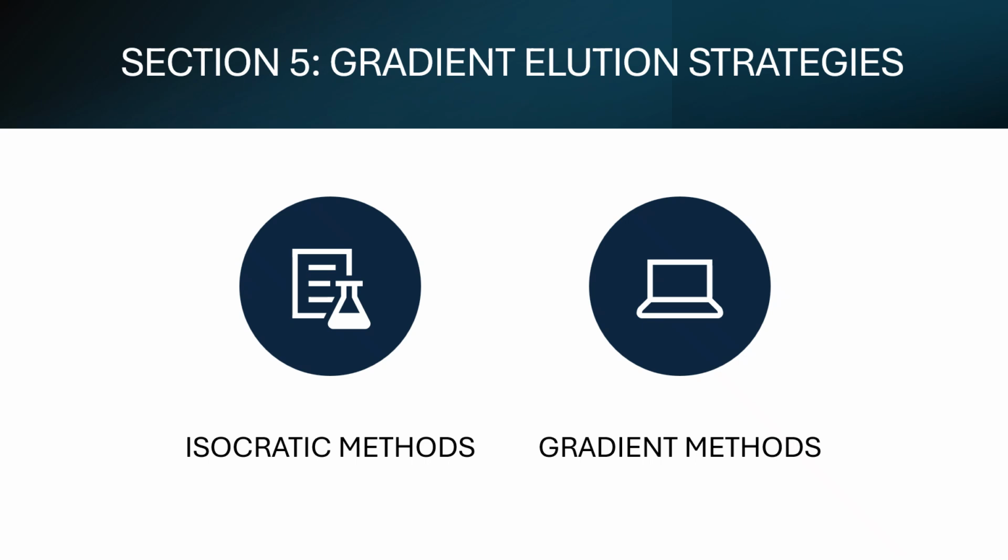So the runtime before the elution is eating your time, eating your analysis time. So when you change the gradient, maybe when you increase the non-polar phase, the peak that was eluting at 15 minutes would elute at 5 minutes or 8 minutes, thus saving your analysis time.